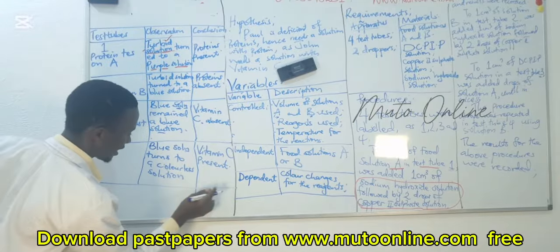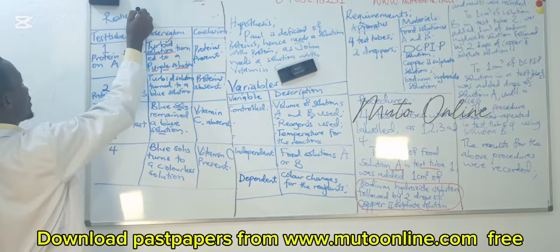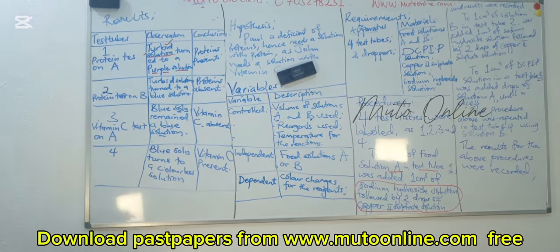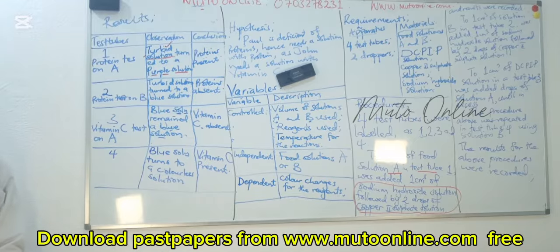So this is our table of results, and these are our results. Not only results, but also our corresponding conclusions.